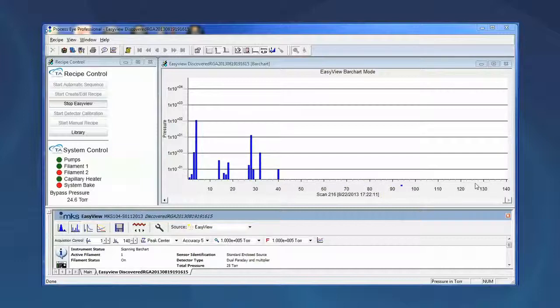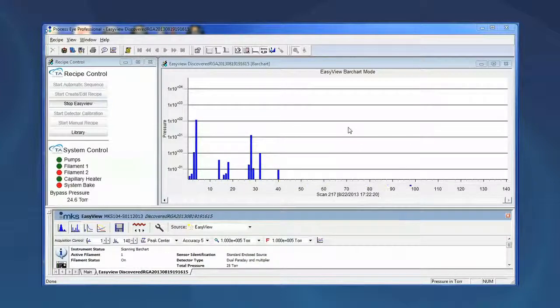We do not observe any ions above mass 40, which is a good indicator that our TGA and mass spec systems are clean and free of any contaminants from previous experiments. We are now ready to run our samples. In this tech tip we expanded the use of the easy view mode. In our next tech tip we will develop a very simple method for determining the performance of our Discovery mass spec detector.